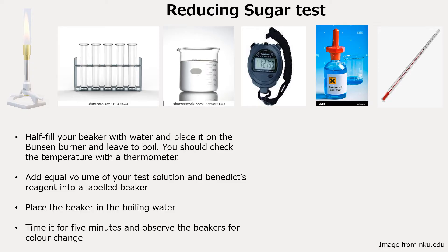You'll be given your test solution and you can take it and add one ml. So let's say that is one ml of your test solution, and on top of that you add one ml of your Benedict solution. You take the entire test tube and you put it into the boiling beaker of water, and you time it for five minutes and observe the beakers for color change.